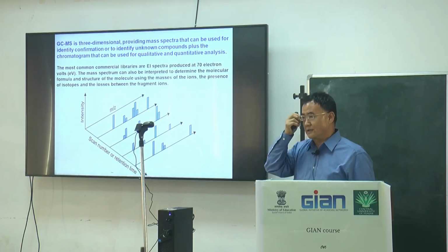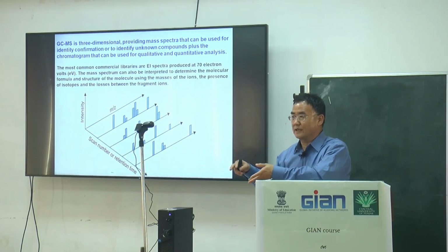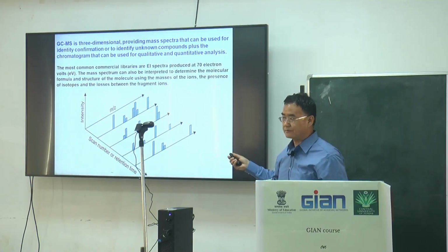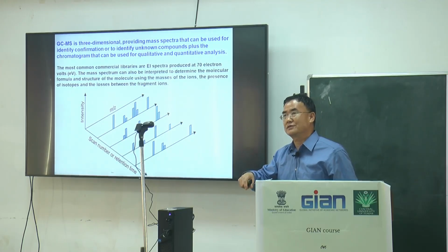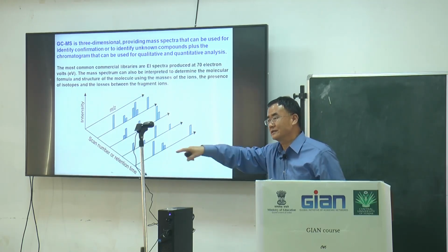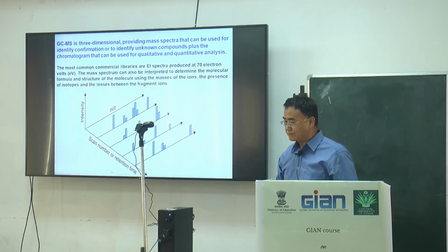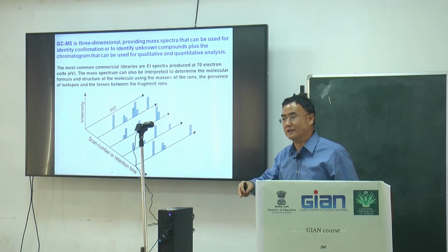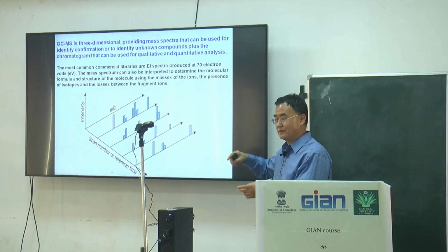The internal standard needs to be similar to the natural fatty acid. Also for analyzing something like a terpenoid, usually we use some terpenoid not existing in this plant. For example, we use vanillin. Vanillin is a small phenolic compound used as the internal standard because it is very easily observed in the GCMS spectrum.